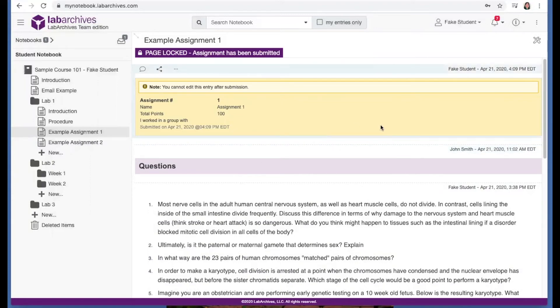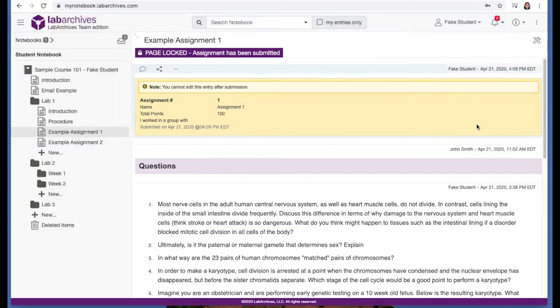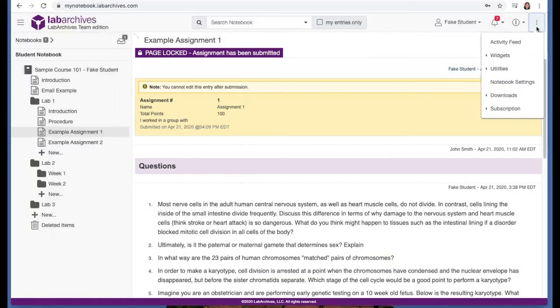Now when your work is graded, you will receive a notification at the top right at this bell icon. And to view your grades, you can click the triple dot icon, utilities, view grades.